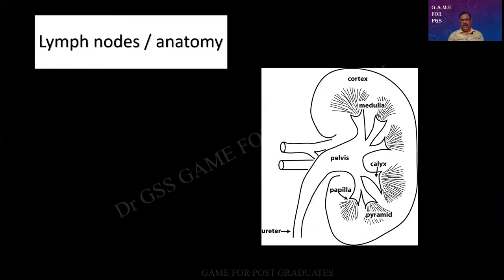The fundamental anatomy you people should know. So this is the renal parenchyma. There is a cortex, there is a medulla. This we call corticomedullary differentiation. So in a specimen, you will have to tell the examiners whether the corticomedullary differentiation is well made out, preserved, or there is a damage to it, something has happened. Also, within the parenchyma, are you able to see any lesion? All specimens need not be neoplastic.